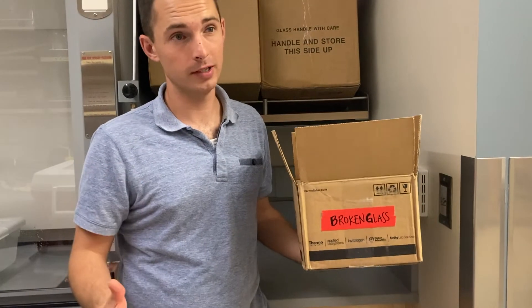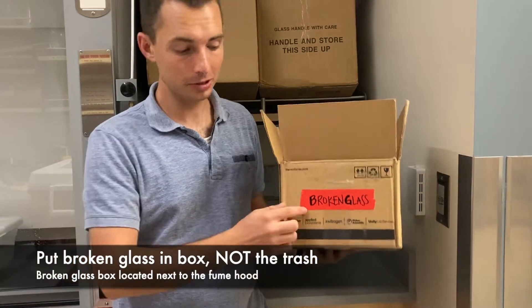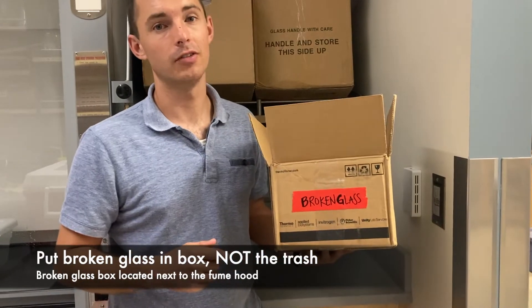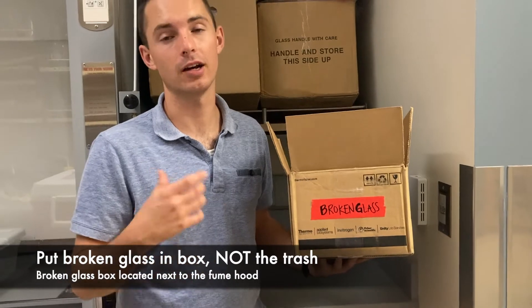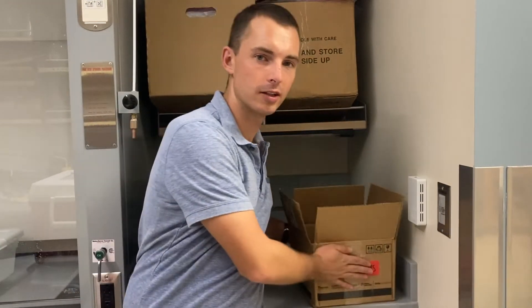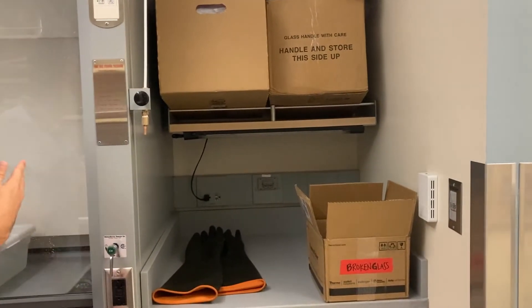If anything that's glass breaks, very, very important — please put it in this box that says broken glass. Do not put it in the trash. If it goes in the trash, it can cut the bag and cut whoever's carrying the trash out. The broken glass box is kept right next to the rubber gloves and the fume hood.